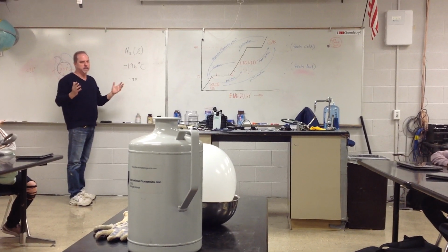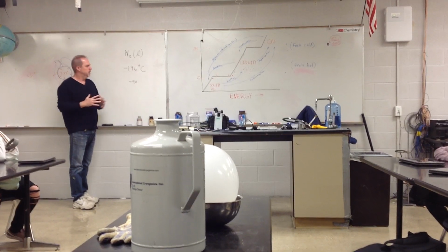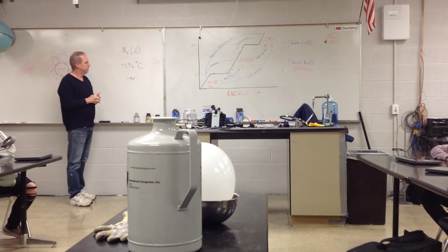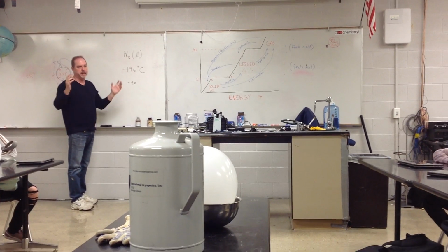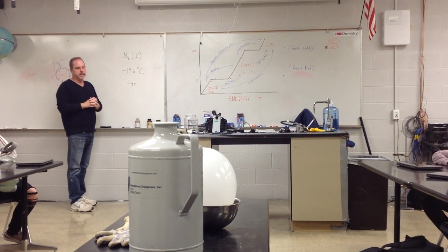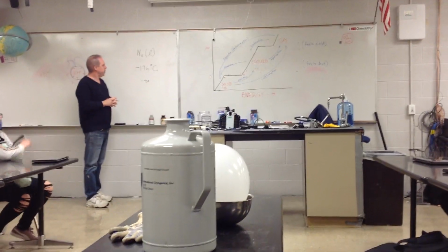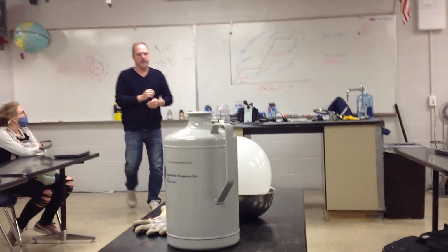Okay, we're talking super cold. So you don't want to mess around with it too much. All right, I know they use it for all kinds of things, like making ice cream or whatever, but you have to be careful with it. Okay, so that's what we're talking about.